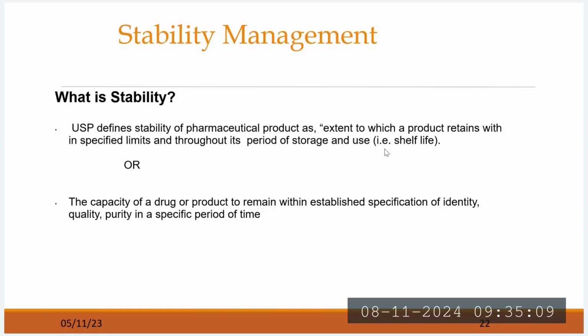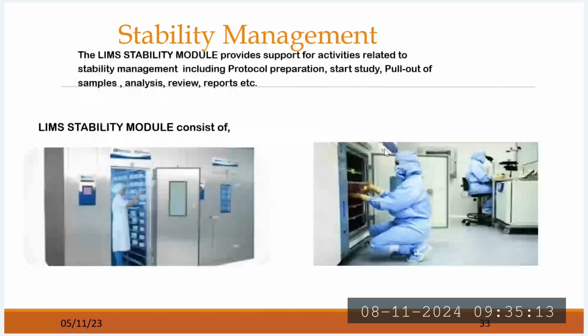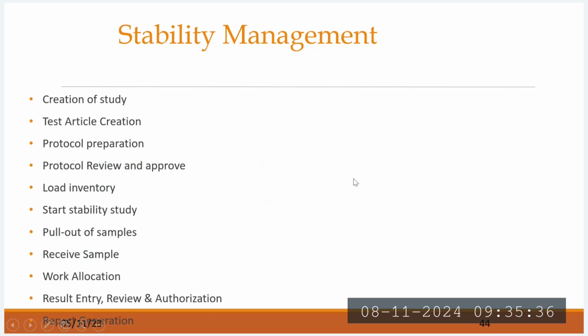If I go through some of the screenshots, like the way I have discussed, it was presenting on the screen the way I am representing on the system. Some physical activities need to be done in some places, like loading. When I click load, the system is not going to load. Physically, I have to go there and place the samples. These are the steps I need to follow manually.